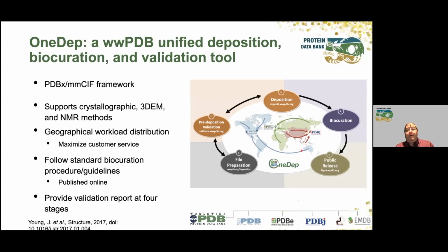So the PDBx/mmCIF framework was used. There are several steps for a deposition. It's like preparing your taxes. You get all your stuff together before you start. You could use our standalone validation servers to check your data, look for any obvious problems before you even start your deposition.